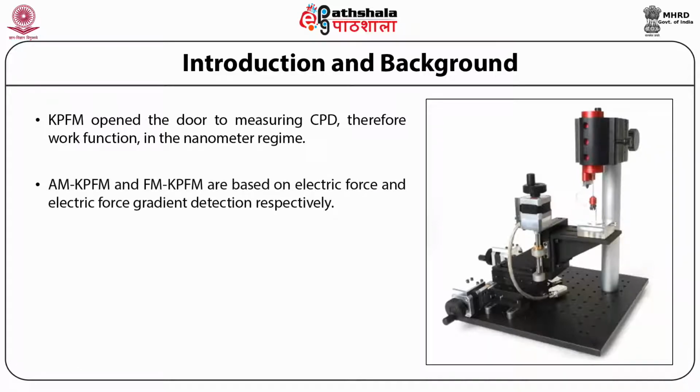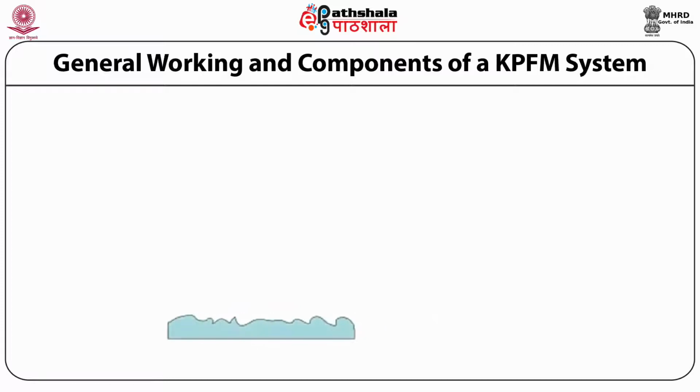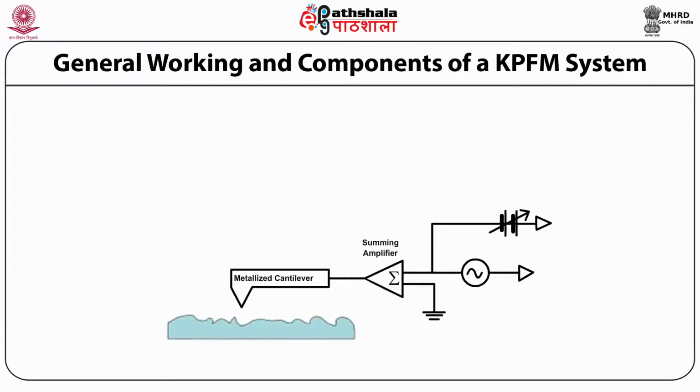AM KPFM and FM KPFM are based on electric force and electric force gradient detection respectively. This slide also shows a photograph of the equipment which is used for these kinds of measurements, and the flowchart diagram which is used for carrying out measurements with KPFM.